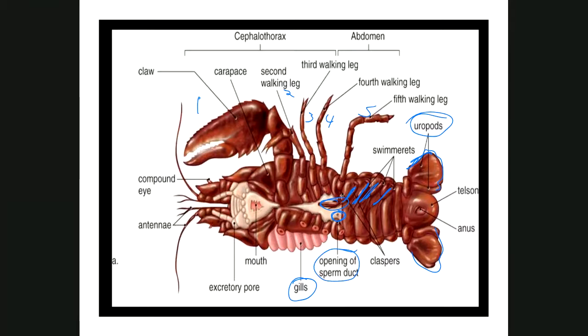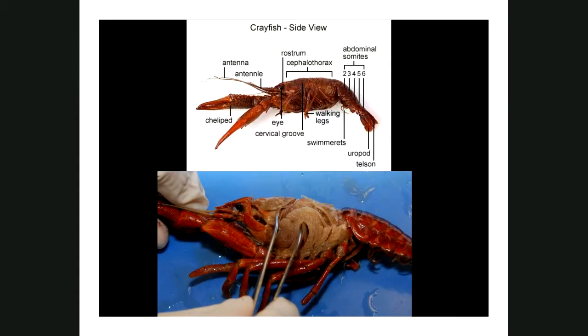Right, what is the carapace? The carapace is, of course, the shell that surrounds the top side of the body. So here's the carapace. And if we were to lift the carapace just above the legs, we would end up seeing this on the bottom picture.